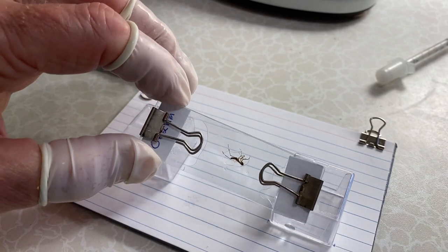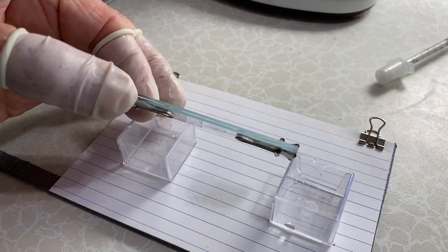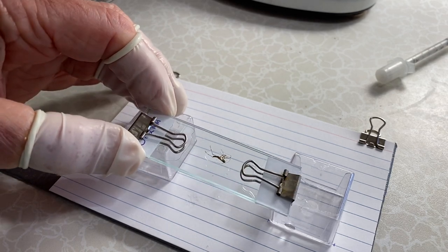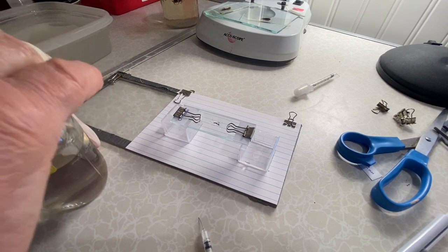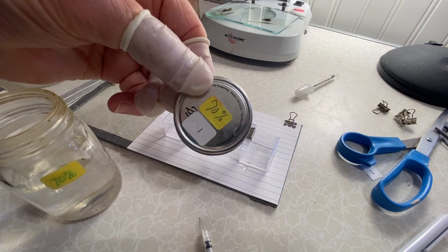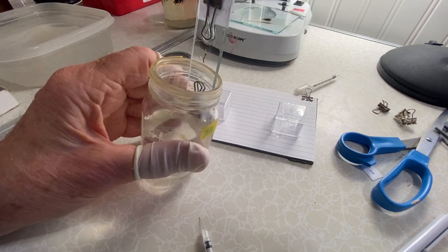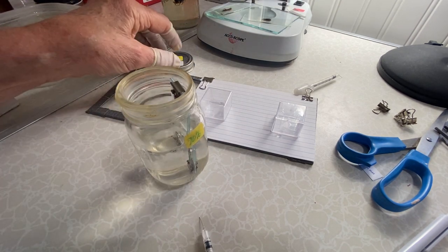Now we have the insect held in place so it's not going to move. It's crushed a little bit, but you can see the space there — that will be adequate for dehydrating. We put it into a vial of 70% alcohol that I previously prepared, check to make sure there are no bubbles on it, tap it, drop it in, and leave it in there for 24 hours.